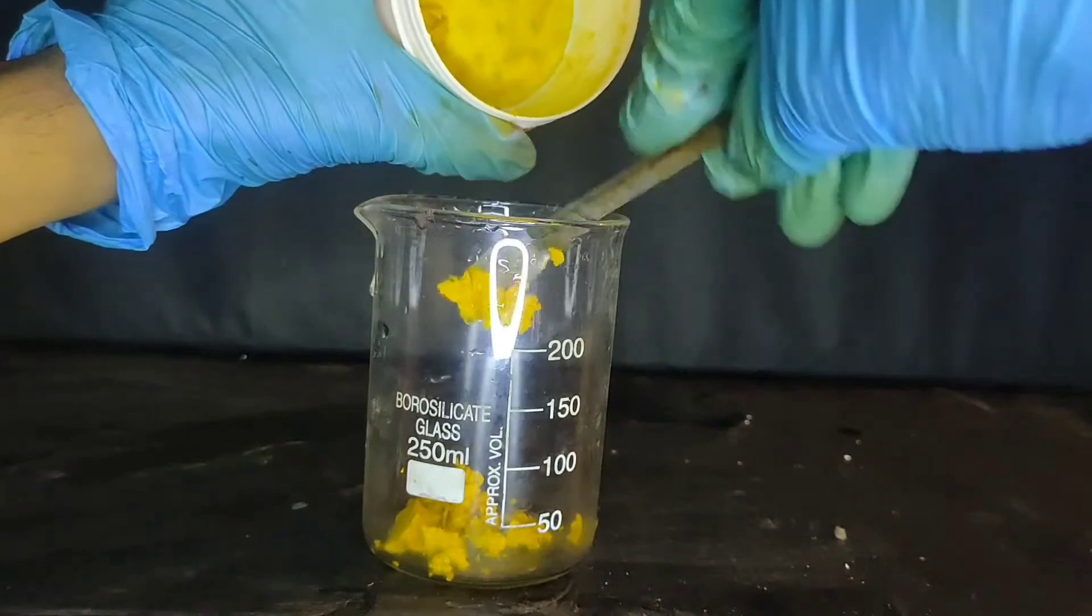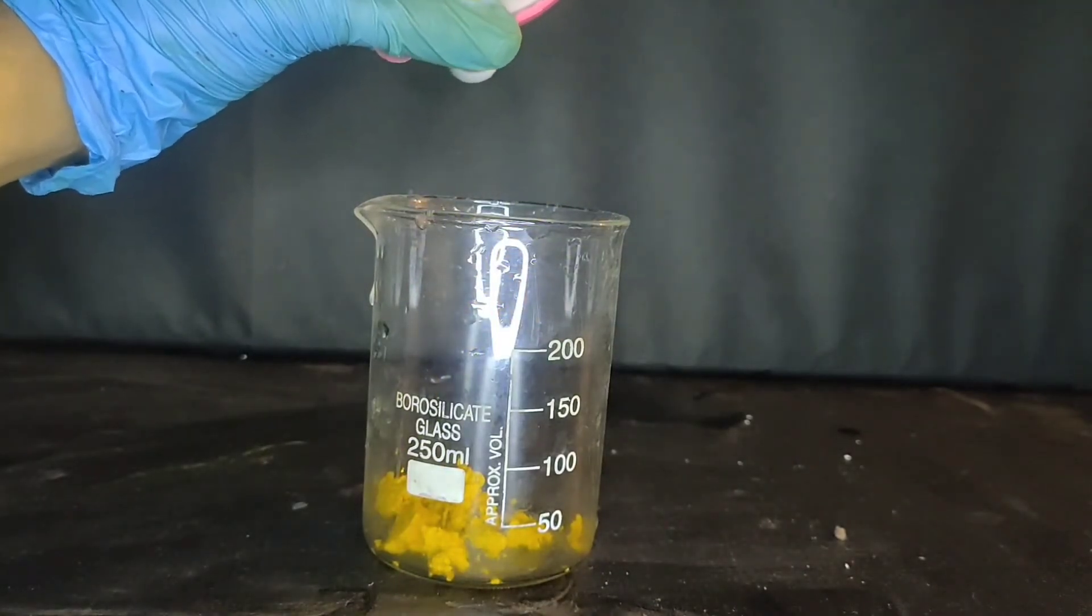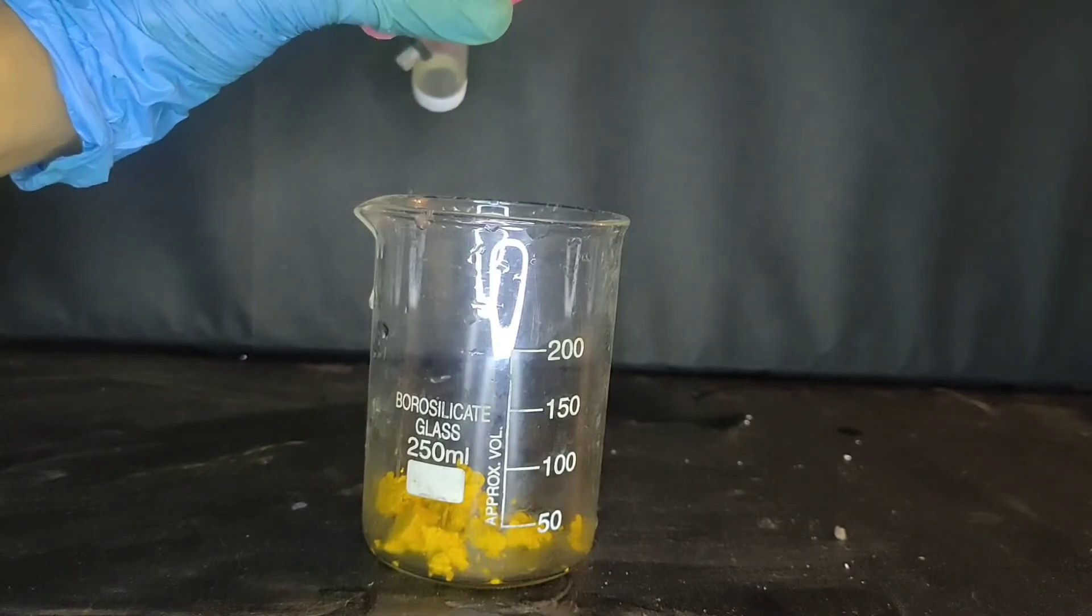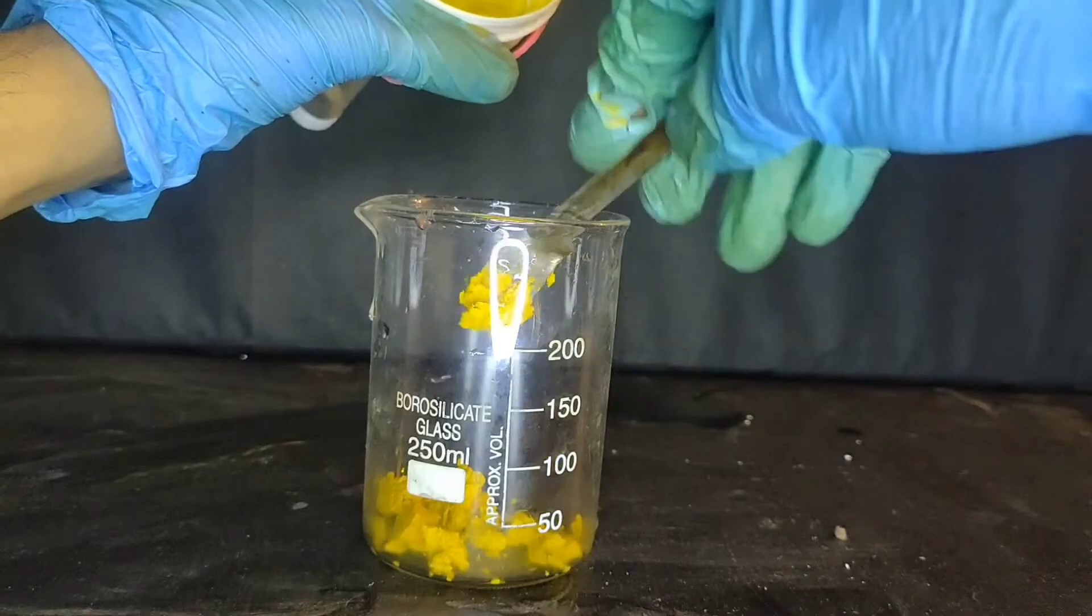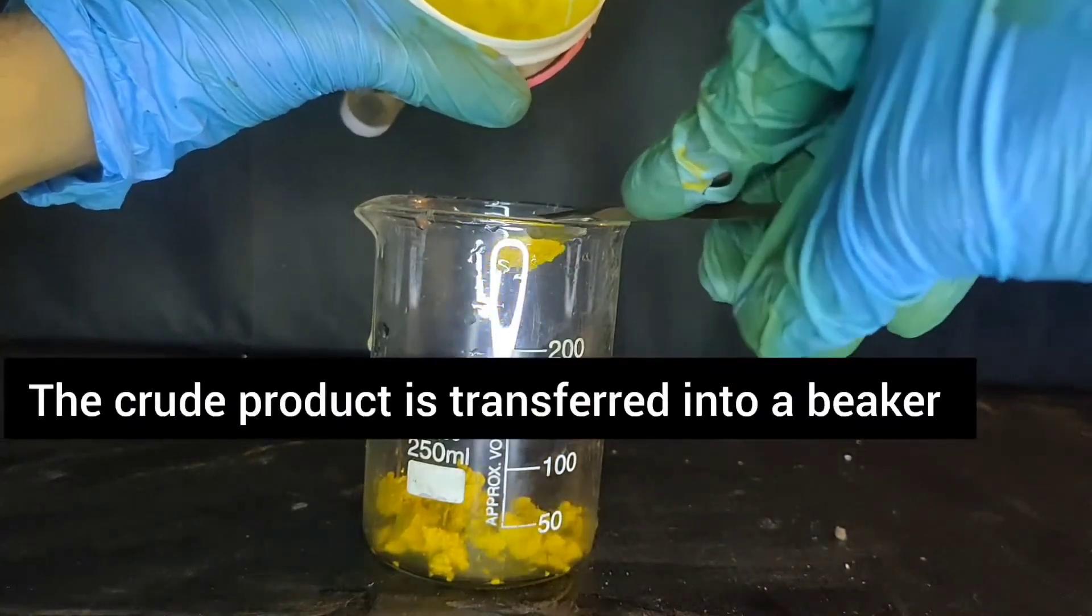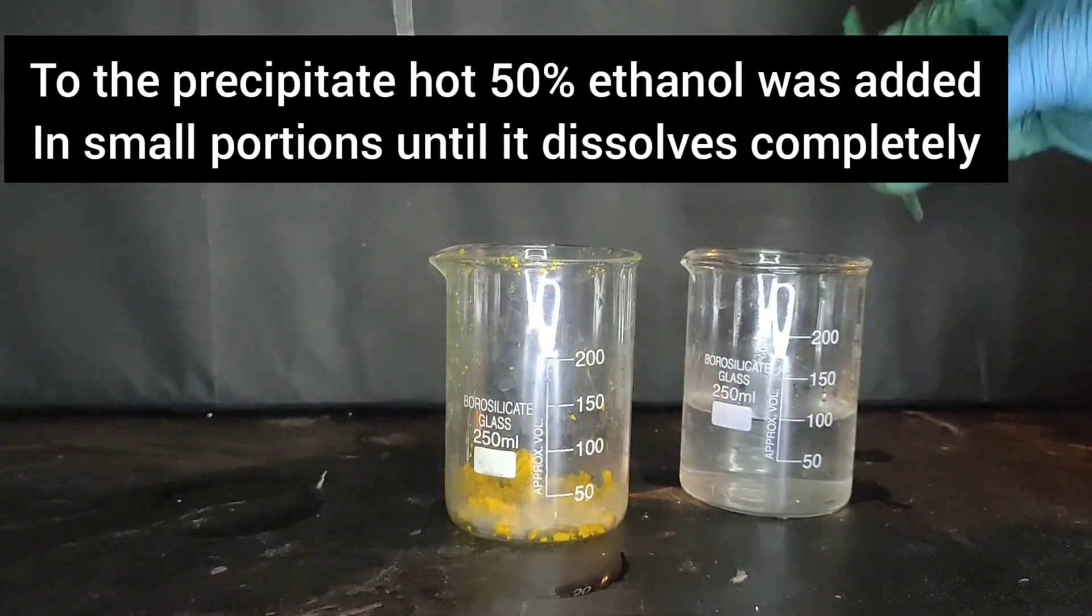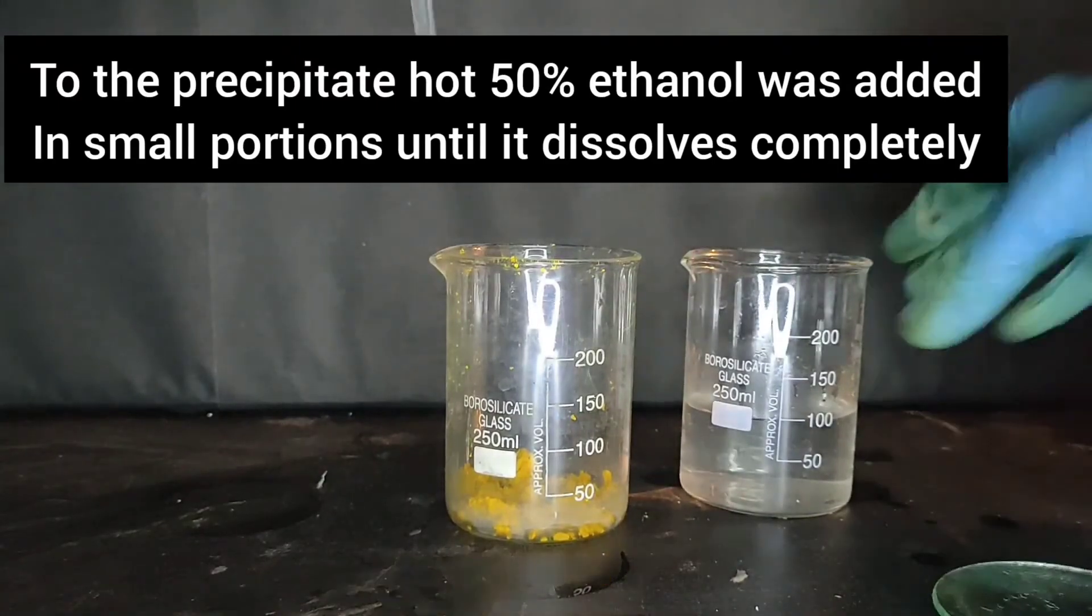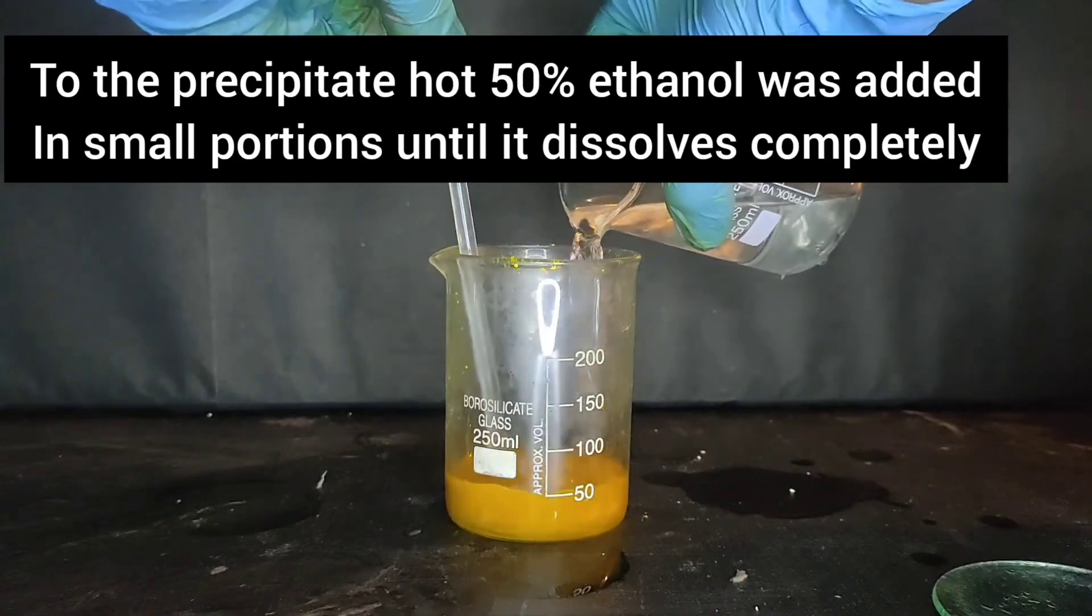This is the crude para-nitro aniline. We will be purifying it by recrystallization. To the precipitate, hot 50% ethanol-water solution was added slowly with stirring, until a clear solution was obtained.